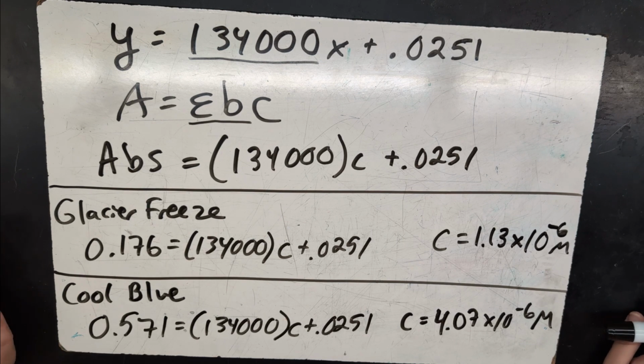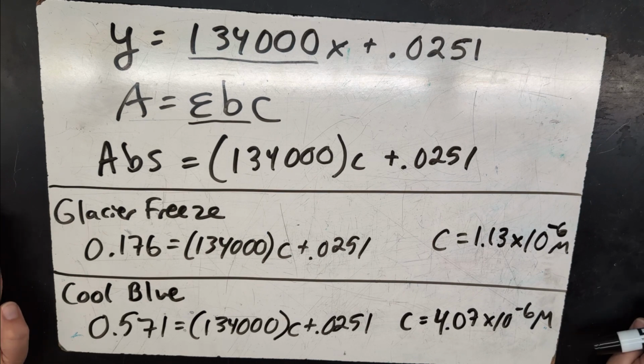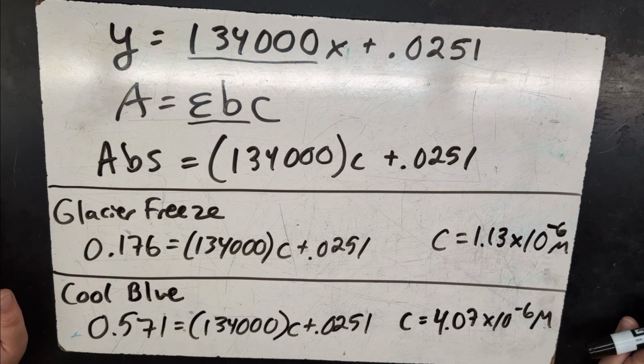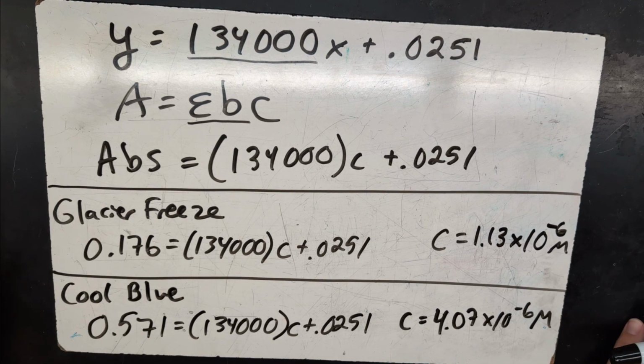Once they get their solutions in the cuvettes, they can just line them up on a white background. Make sure it's a bright white background and make sure that they have the blank as well right next to them. So that way when they essentially use their smartphone camera and the particular color analysis app, you can do a comparison between the blank and the different dilutions and graph it that way. And then you can take your two test solutions and compare that to the calibration curve to see where it fits. So definitely that technology is super useful.